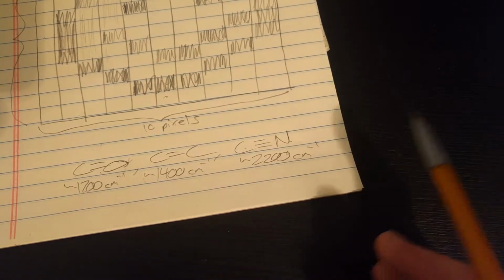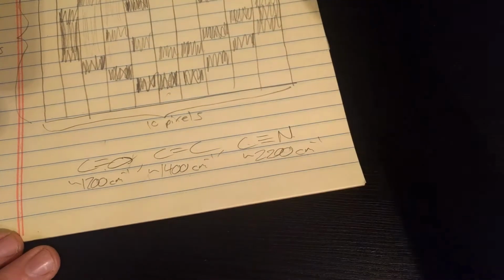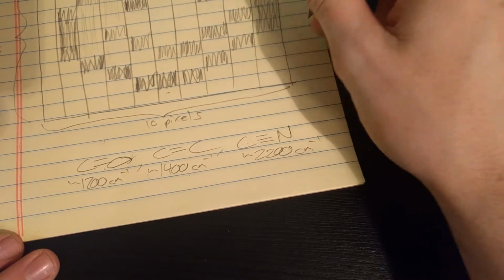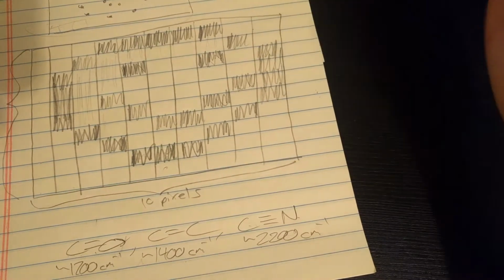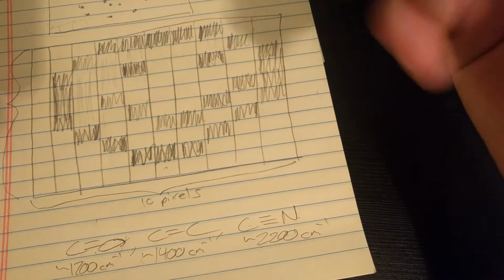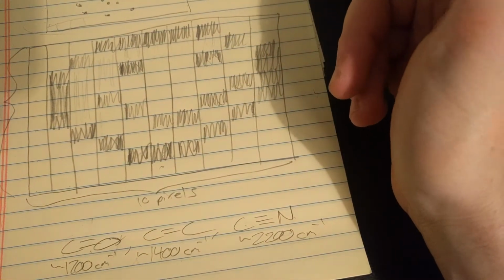And I think you know what that means. That means each image is specific to its own unique chemical or its own unique vibrational mode. And chemical specificity is one of the major advantages that Raman imaging has over other imaging techniques. So, I hope you understand how you can obtain an image or a picture by using Raman spectroscopy.